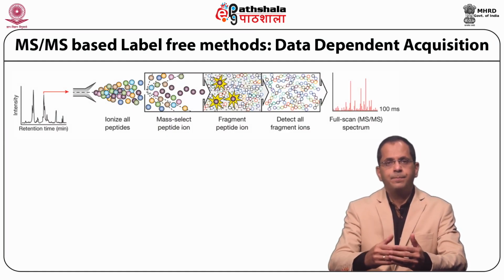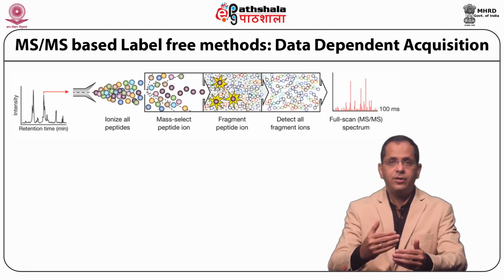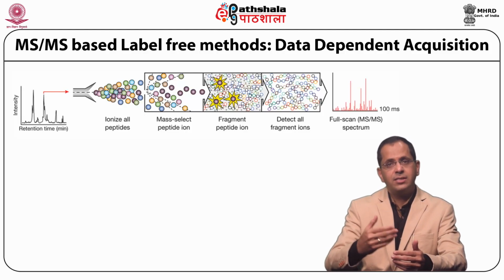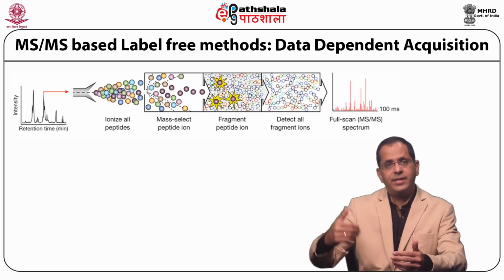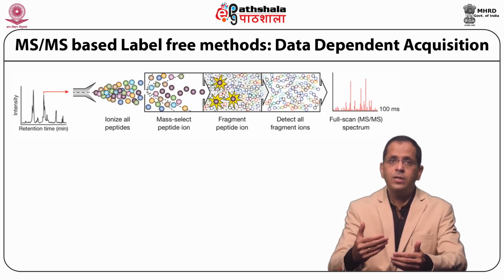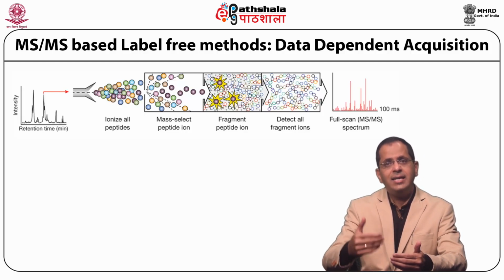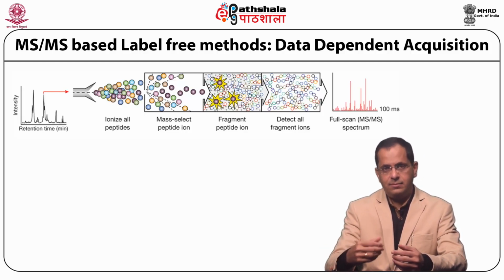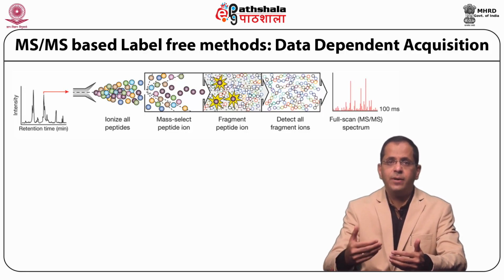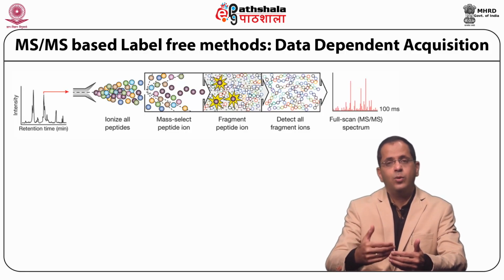First of all, the principle: peak intensity of any ion should be proportional to its abundance, which is the ion signals in mass spectrometric analysis. Recent advances in LC-MS approaches have allowed correlation between protein abundance and the peak areas. That is, the number of MS/MS spectra has widened the choice of analytical procedure in quantitative proteomics.